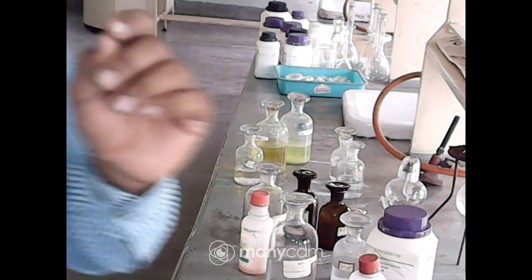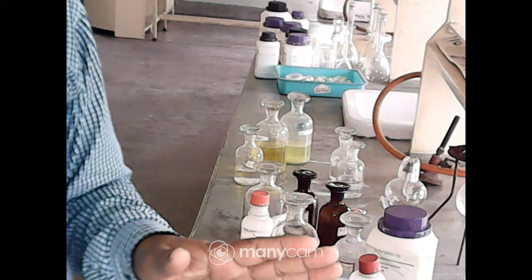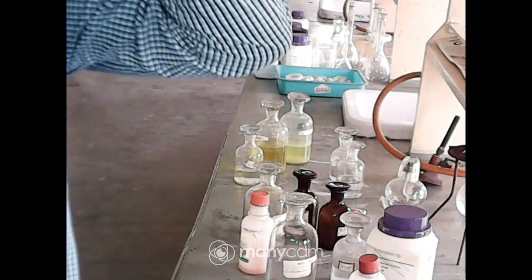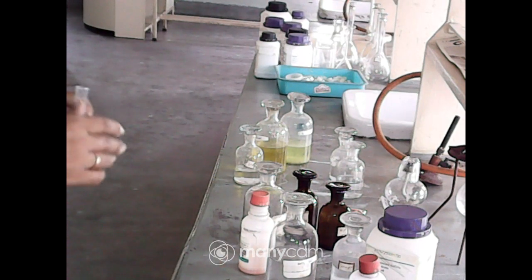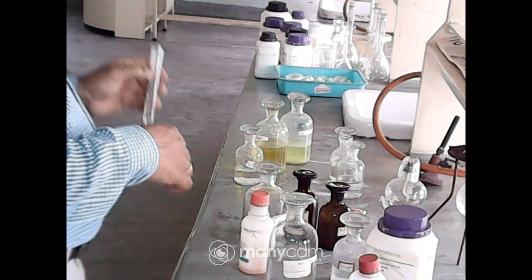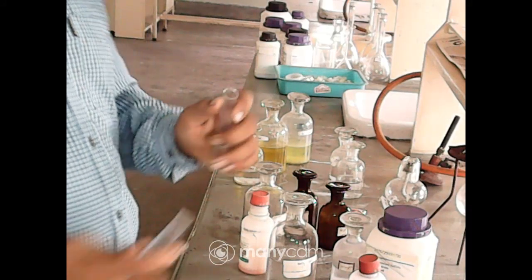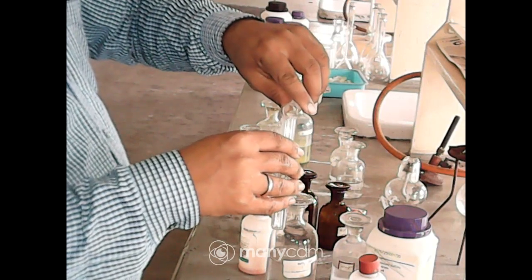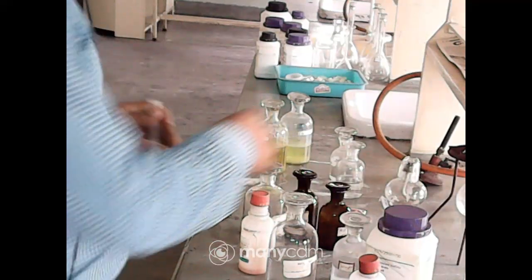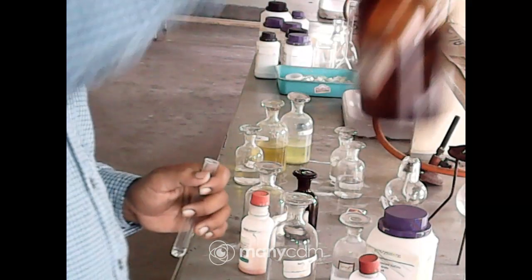So if you get ammonia, it becomes easier for you, as in systematic qualitative analysis at first you will get it and write it. The next procedure is not required on that aspect. Next we have to go for the anion. For that anion we will add AgNO3. Okay, so just adding AgNO3 from this bottle.